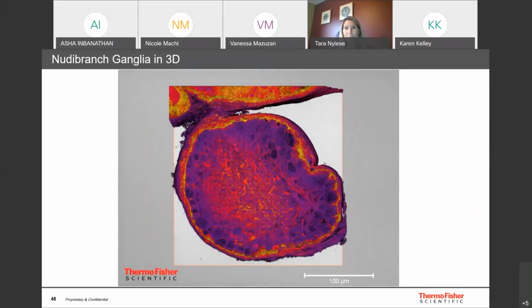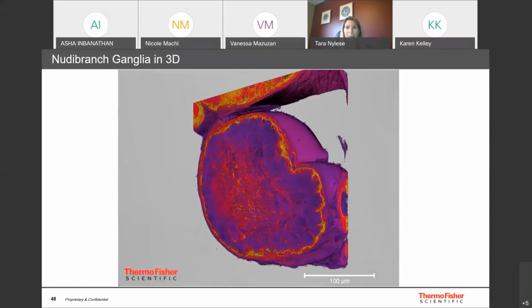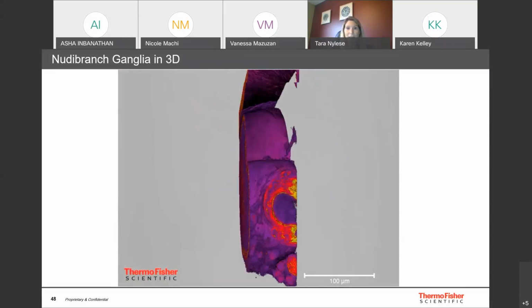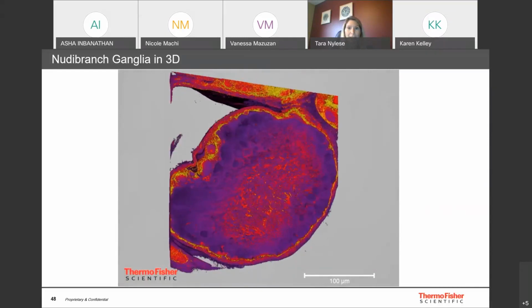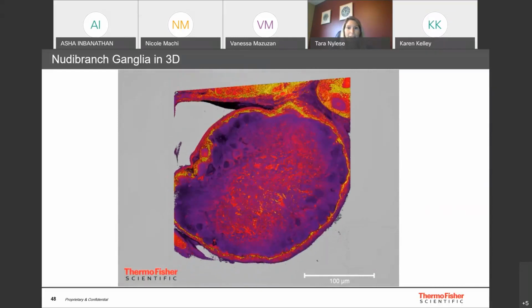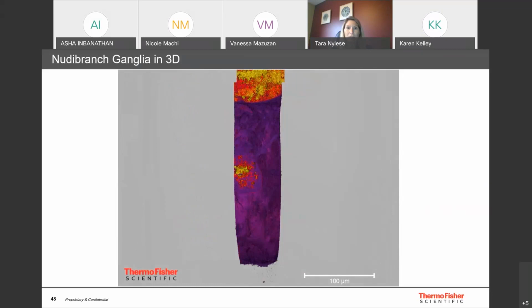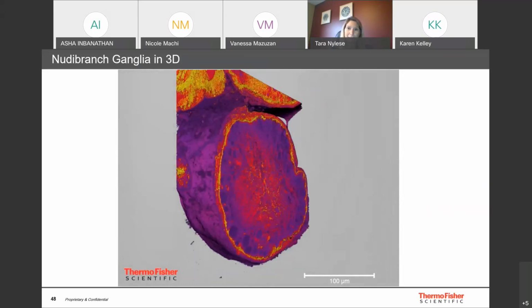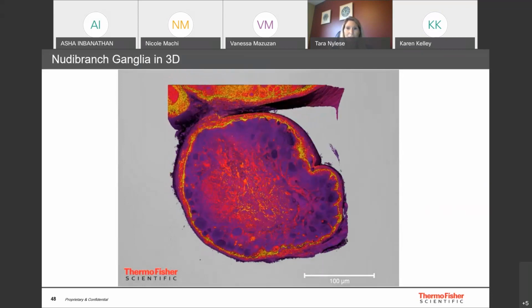And this whole area was collected, but as you do the visualization, you could zoom in and zoom out. You could retain the higher resolution of the original collection. You could focus in on a certain area to look at that area in detail. And of course, rotate it, select certain areas by color or by other morphology. You can do some intensive work on segmentation, looking at specific features of interest and selecting those and segmenting those out. And then you could, of course, cut through them and see different perspectives as well.